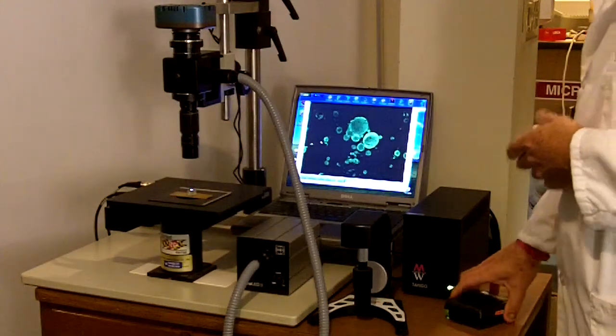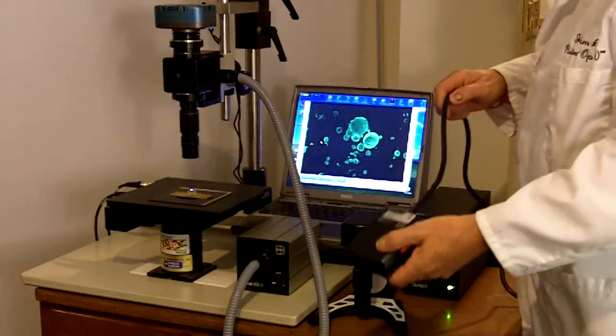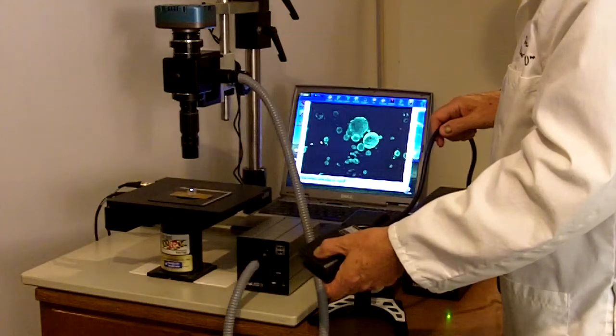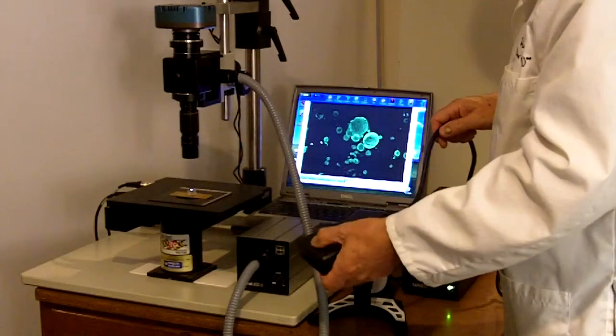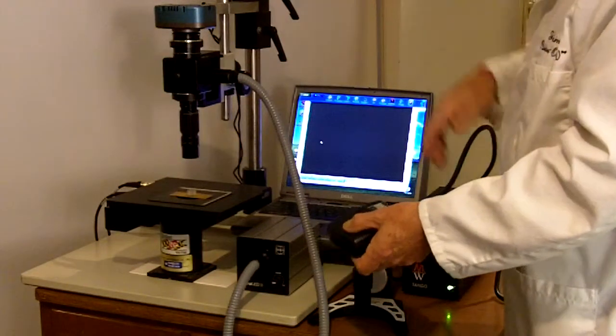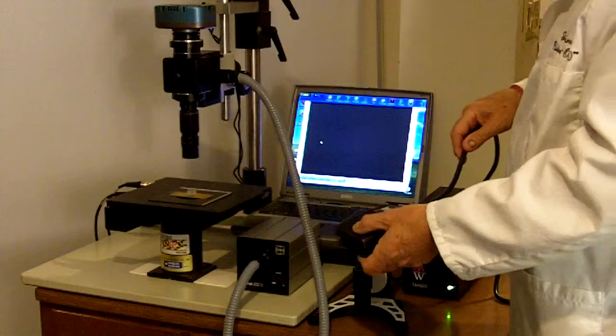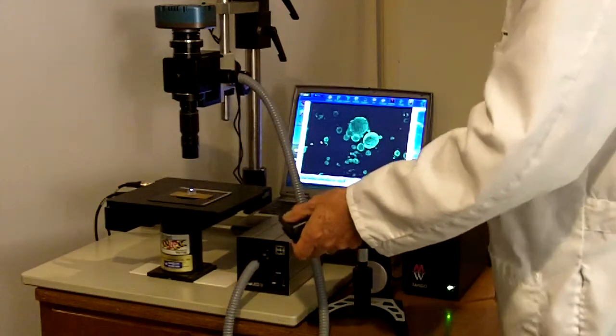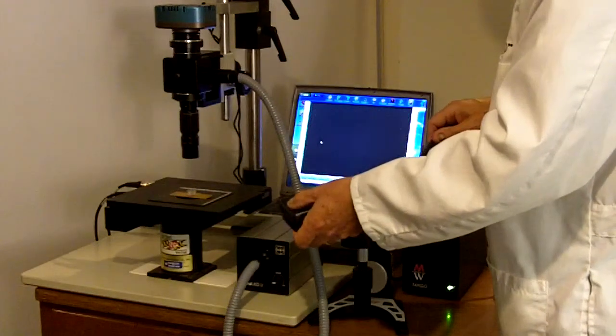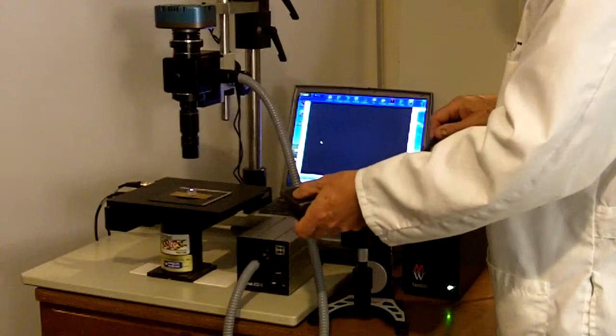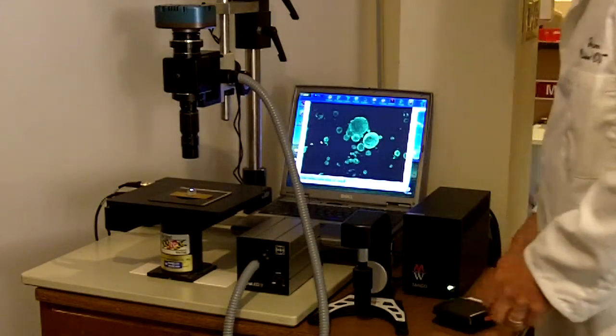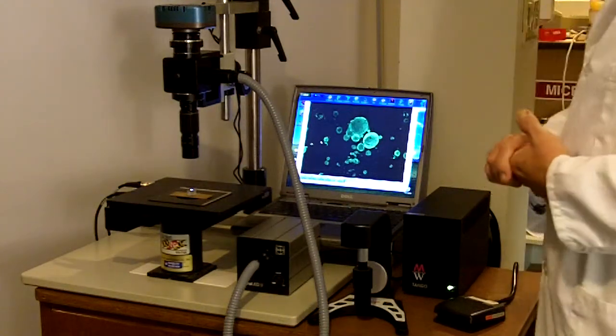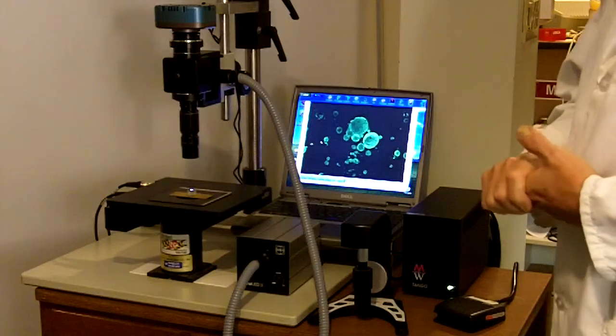And quickly back to the LED illuminator, also available as an option is a foot switch. So that if you're working quickly and need your hands free, you can shut off the light and then bring in white light externally for checking focus or field of view and quickly bring the sample back into location. This is difficult and expensive to do with a mercury arc lamp. And this system is a lot less expensive than some of the newer metal halide lamps that are out there. This is about half the price of a metal halide lamp.